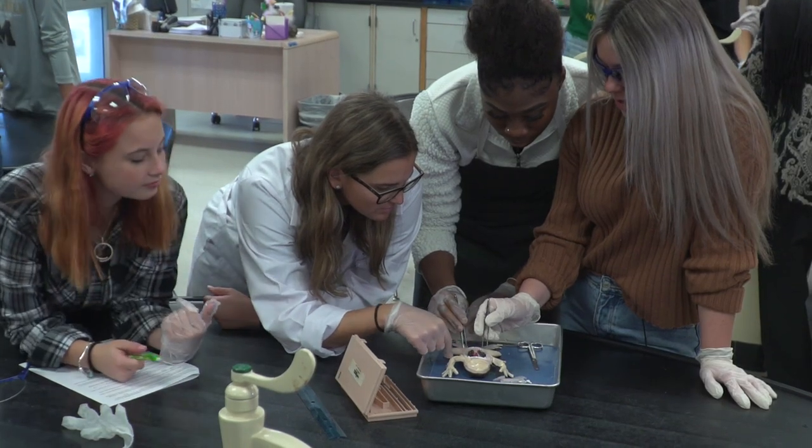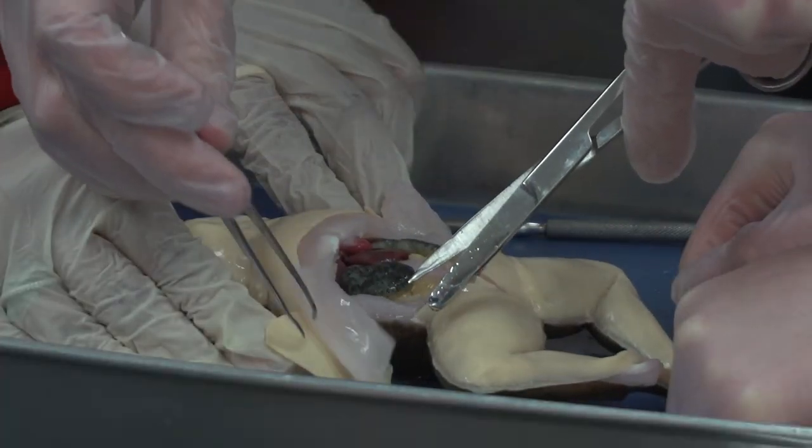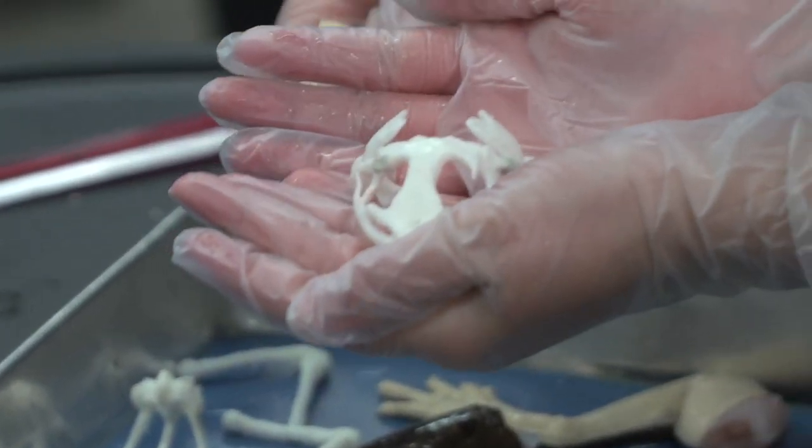We don't have to provide one alternative assignment, and in the past we've absolutely had to do that. So if people embrace this and look at it as an opportunity for all kids to have this experience and for everyone to be a part of it, I think the fields of science for these kids will open up dramatically. I have never seen 30 kids that engaged in anything they've done, especially in a science class like that — it was unbelievable. Those individuals who would rather not have an animal die for them to learn are going to be able to have a superior experience and become part of that education without having to carry that guilt.